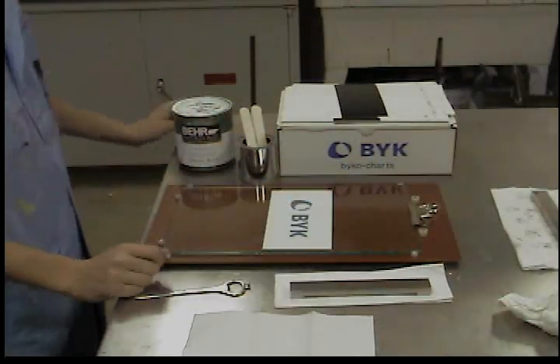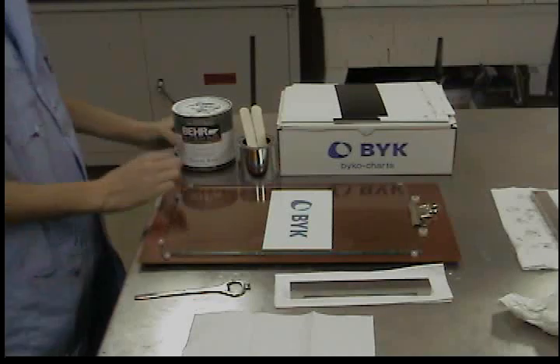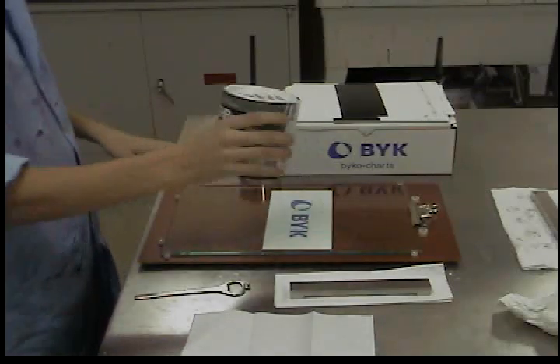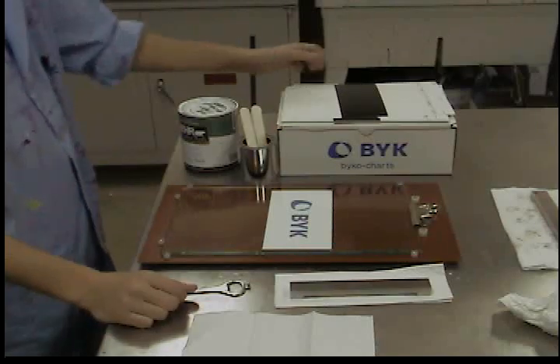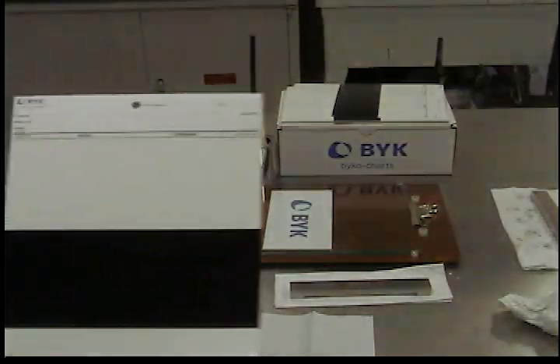First, ensure that the paint is uniform by shaking or stirring the sample. Next, label the Bicco chart with the product name, batch code, applicator type, or any other information that will help to identify it later.